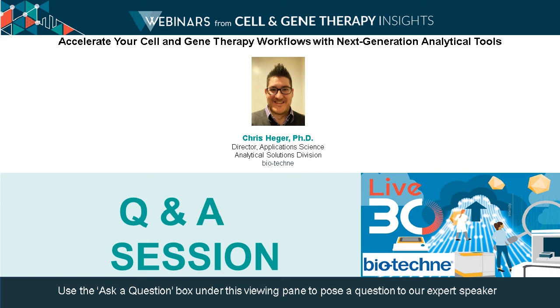Yeah, that's a good question. So we have two examples I showed today: the isoelectric focusing method on Maurice, and the size-based separation on our JESS Simple Western platform. I think they both have solid strengths. The Maurice method is a direct detection, a little bit more amenable to downstream, but it is isoelectric focusing, so you may have to develop a method a little bit more specific for your AAV than what I showed for AAV9. The size assay seems a bit more universal in that respect, although it does rely on immunodetection.